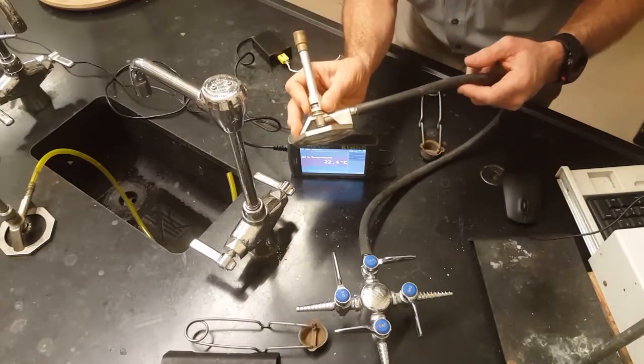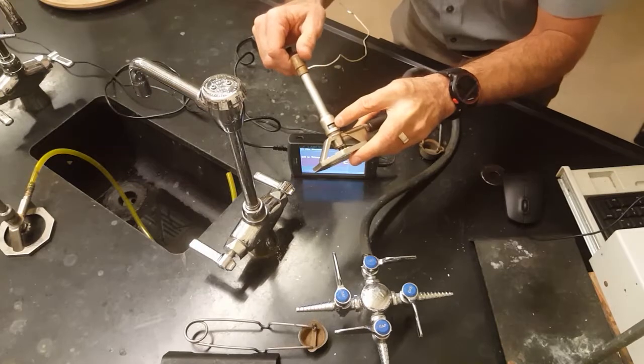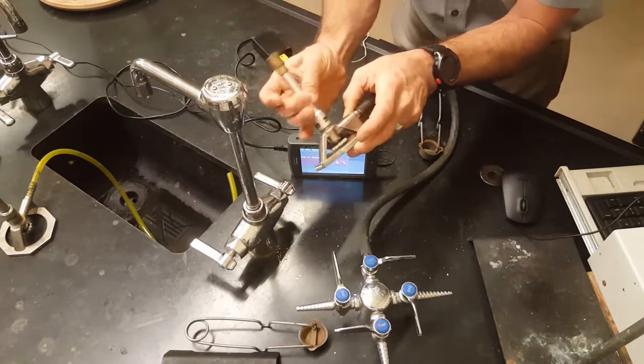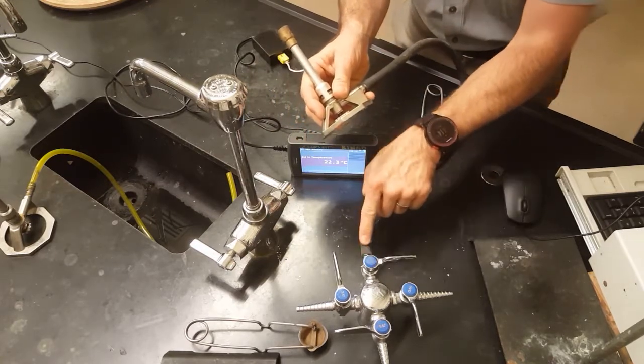That is your airport. The airport is really a carburetor, and the carburetor's purpose is to mix air with the gas that comes out of this, which is your bench top gas valve.